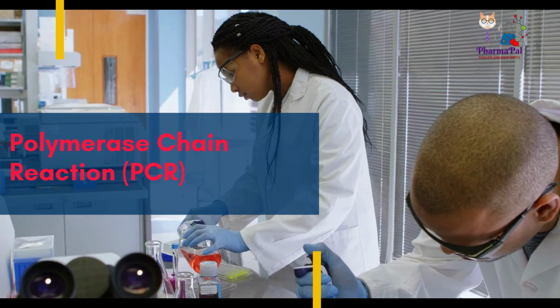Competitor RT-PCR is a technique used to determine the amount of mRNA in a sample. By adding a known amount of competitor RNA, we can estimate the target mRNA levels by comparing the amplification products. Nested PCR is a method used to reduce contamination and amplify specific target sequences.